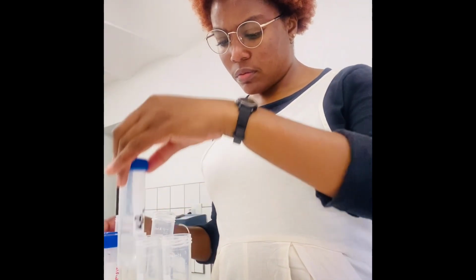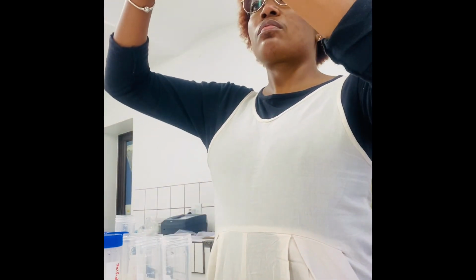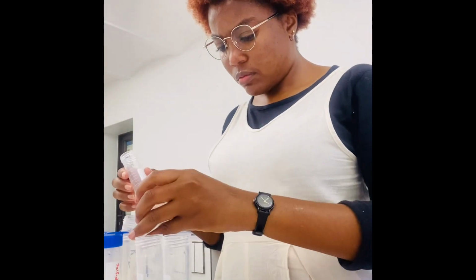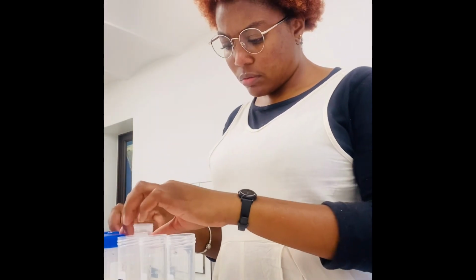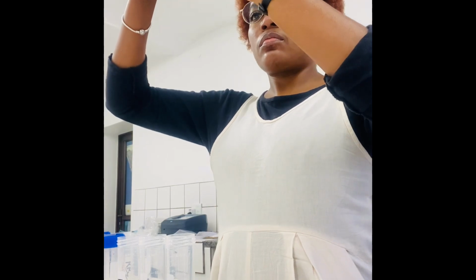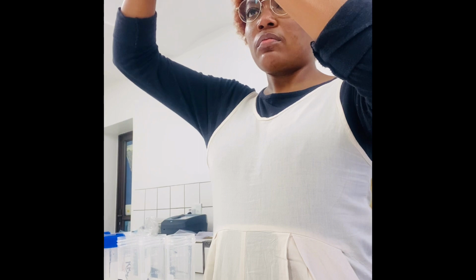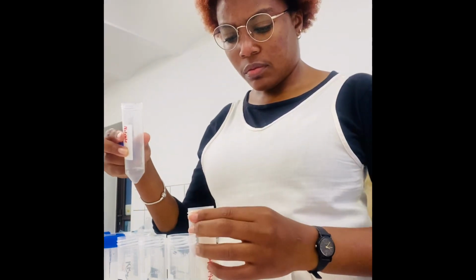For other waters, for example water for consumption, which is potable water, and water at treatment plants, both fresh water, and water from the rivers, they will give different readings, and they also use different reagents. But for seawater, we only focus on the seawater, and we also get different results.